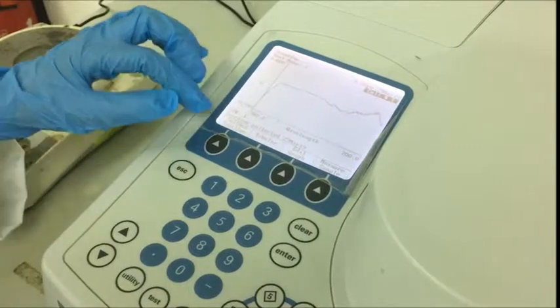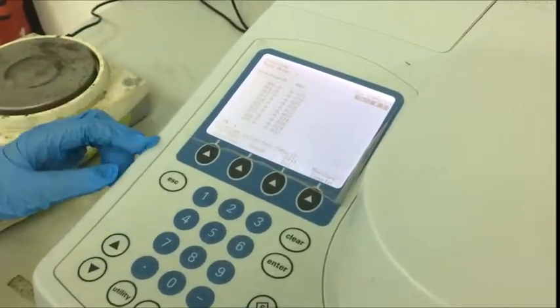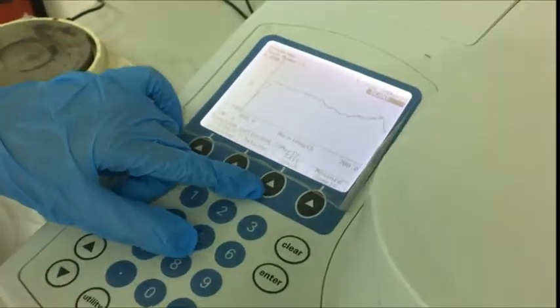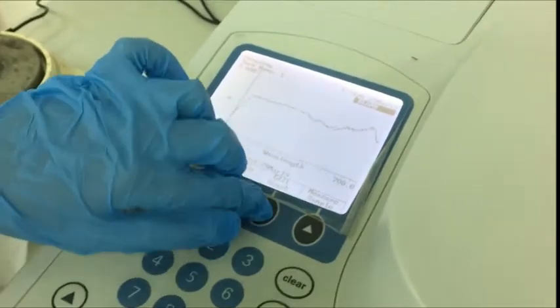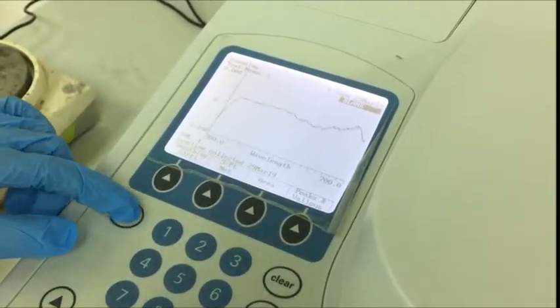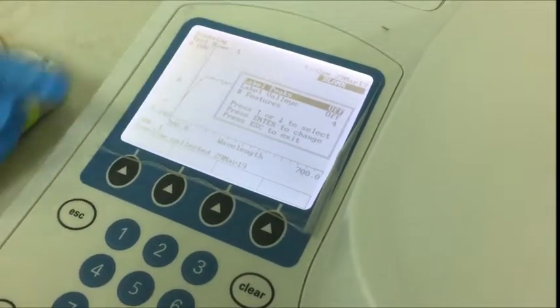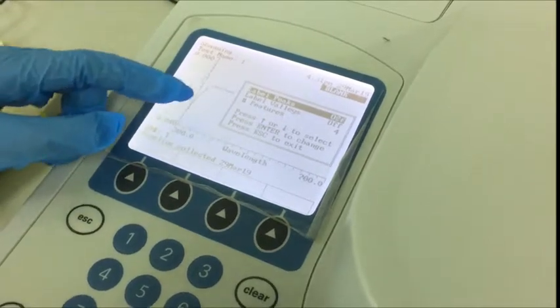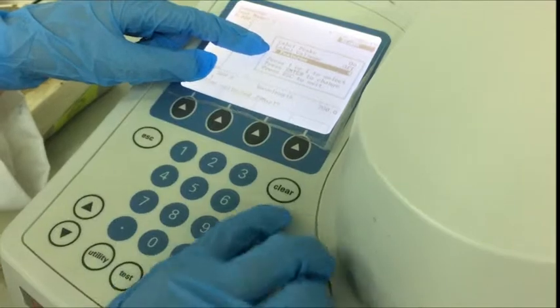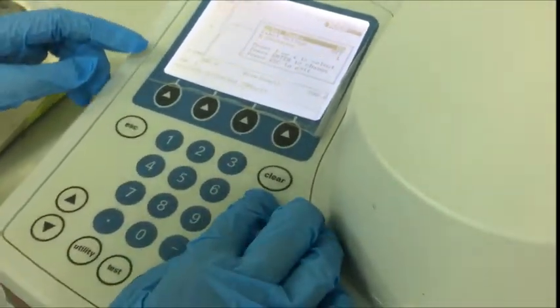I can find out the maximum wavelength by clicking on the tabular. The method to find the highest wavelength, you can also click on edit graph, and I click math, and I click peaks and valleys. The label peaks you must click on, then the features you select 1, enter.